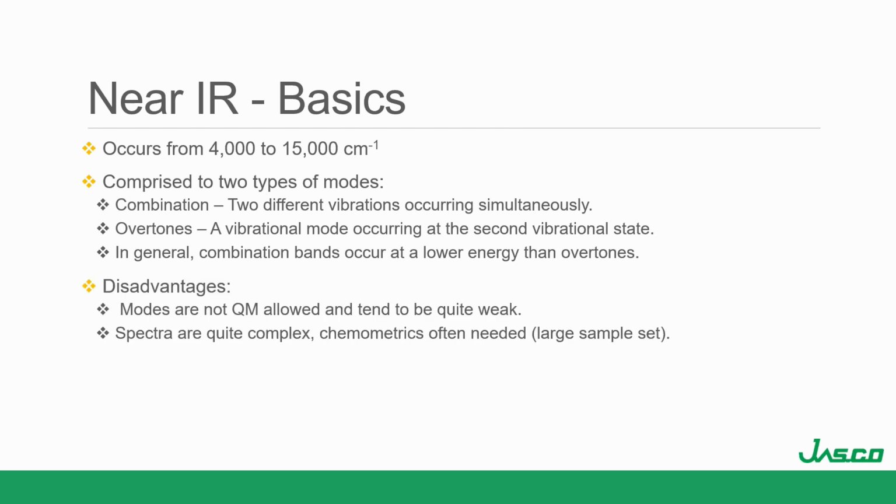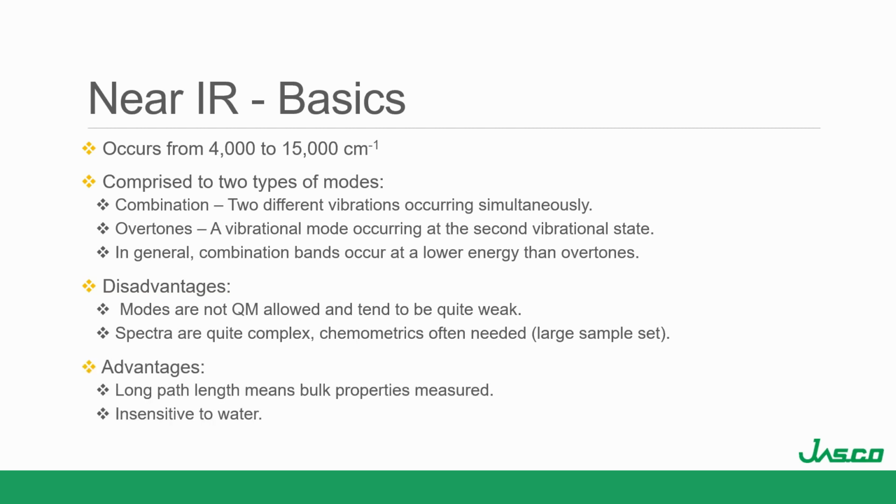The disadvantage is that the modes aren't technically quantum mechanically allowed, which I always find funny that it happens anyway. And they tend to be quite weak. The spectra are very complex usually, and a lot of times you need chemometrics to do it. But the advantage is that you have a long path length, which means that bulk properties can be measured, and it's insensitive to water.